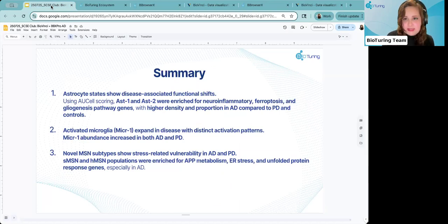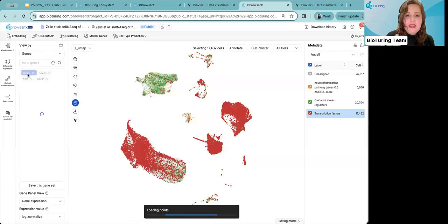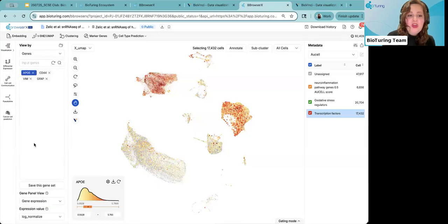So that's through the density layer. If you are planning to run that, it is now available for you when you're looking at an individual gene within the UMAP. You're able to now look at the density of that particular gene and look at the layer of that density as well. So that's a feature that you're able to run currently.